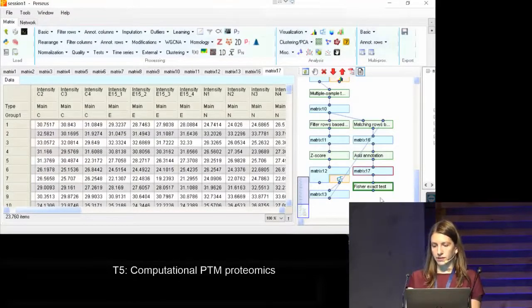We can go ahead. This will again take a bit because of the size. So we have also 6 clusters, we have many categories, and then we have a very large number of sites that the enrichment will be happening on.